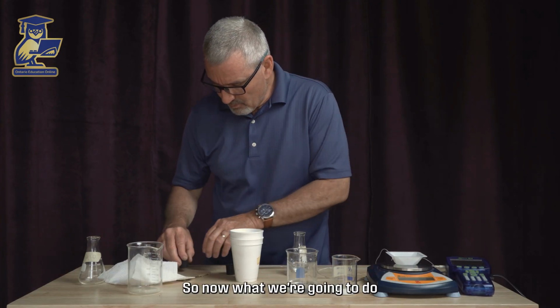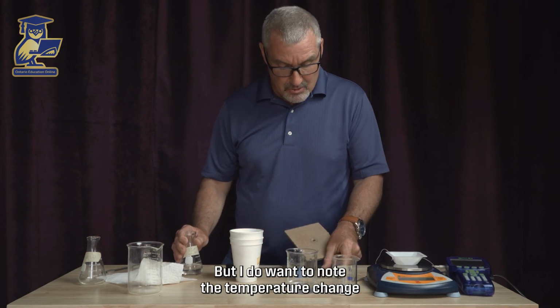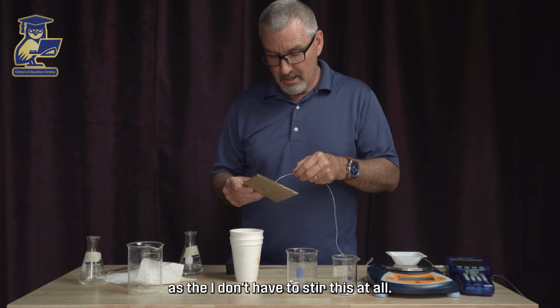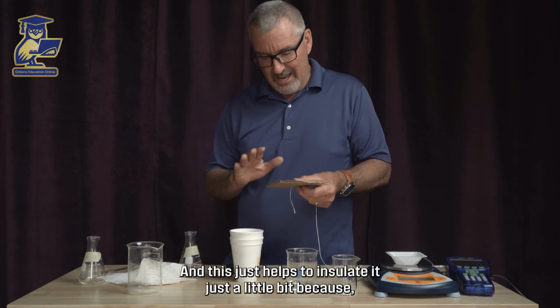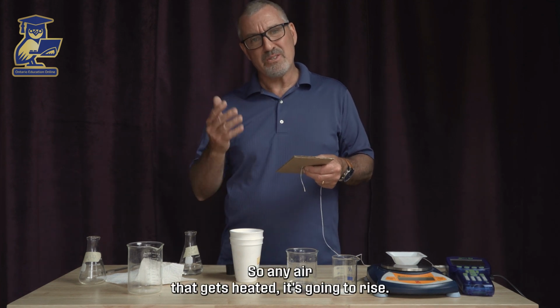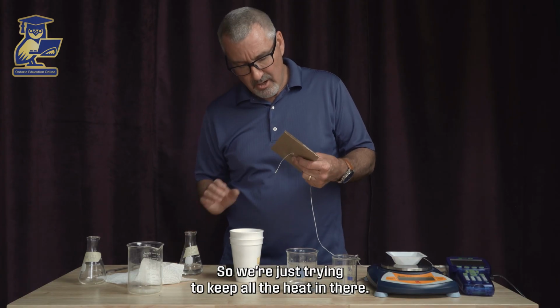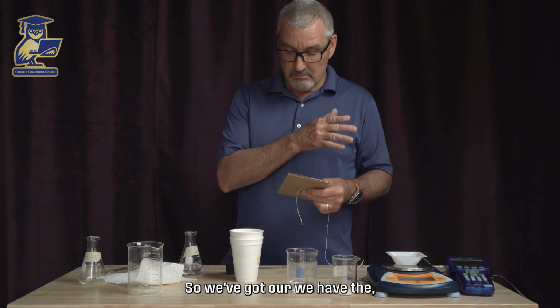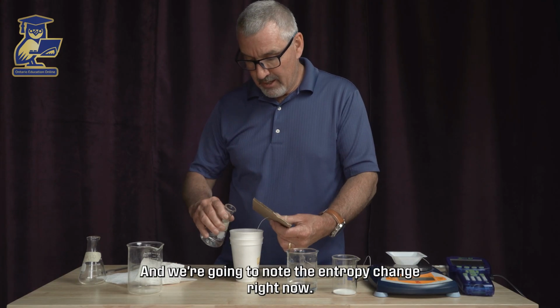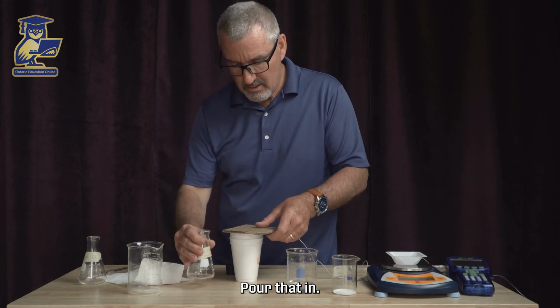So now, what we're going to do, now this is going to mix very well, but I do want to note the temperature change as I don't have to stir this at all. And this just helps to insulate it just a little bit, because warm air is going to rise, so any air that gets heated is going to rise through. We're just trying to keep all the heat in there. So we have the digital thermometer ready, and we're going to note the enthalpy change right now. So we're going to pour that in.